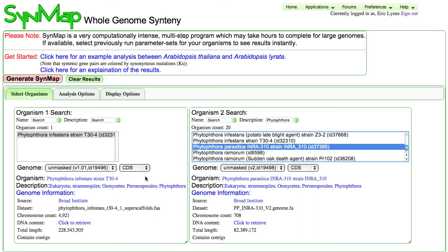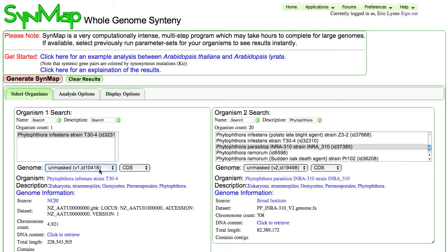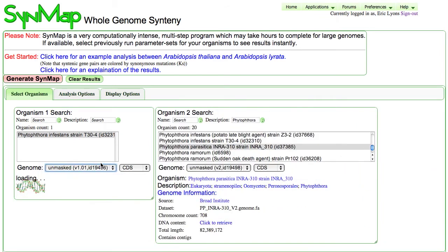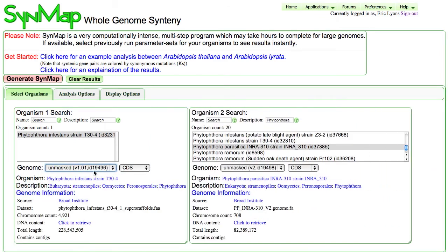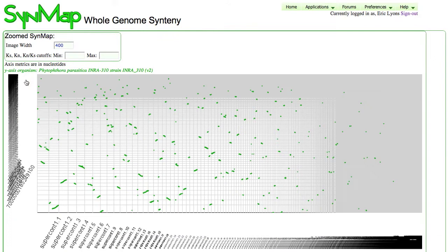And so in here, I want to compare the two strains that are from the Broad Institute. I can see that there's many to select from. This one happens to be from NCBI. The one at the top is from Broad. Same with the parasitica. And once I've got these two selected, I'm just going to compare the genomes using the default settings using SynMap.